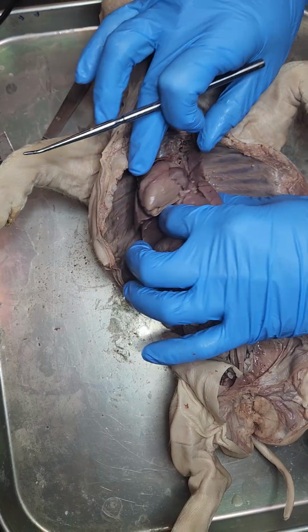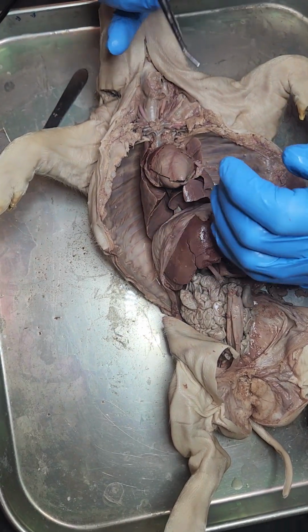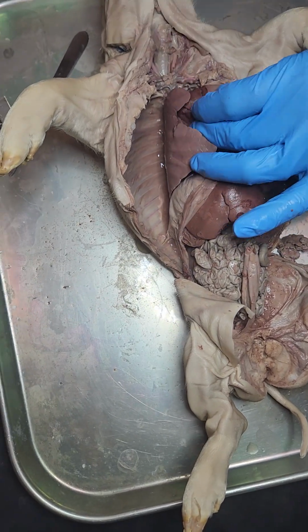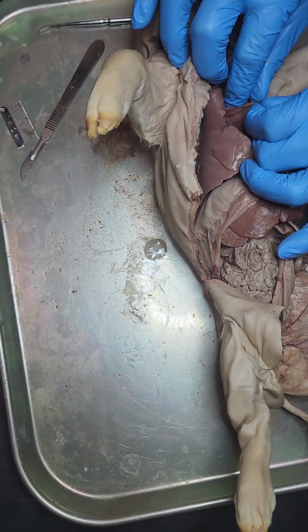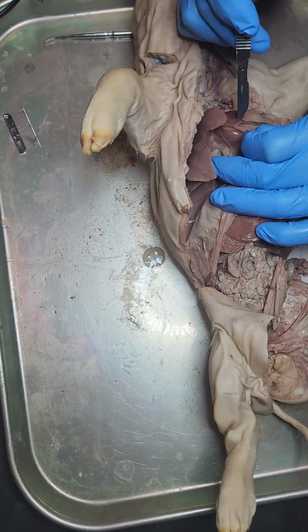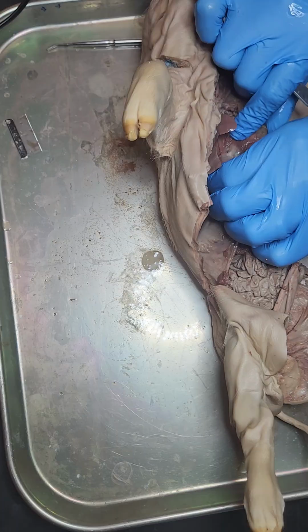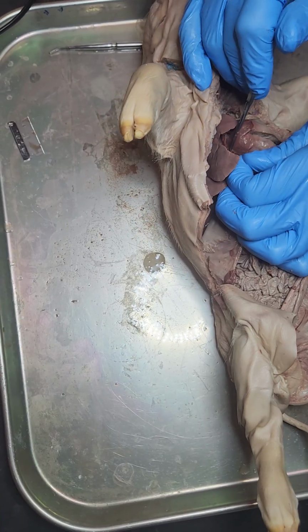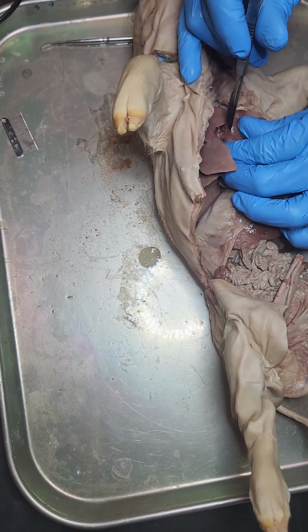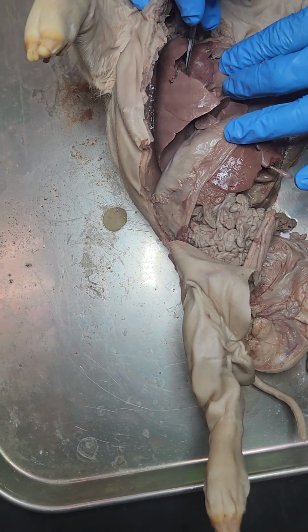Okay. Lungs, so here are your lungs right there. And then we have the pulmonary vein. Now the pulmonary vein is what comes from the heart in. And we will have to clean it up just a little bit. Okay. So we'll just take our knife and sort of clean this out right here. We're going to trim this pericardium back so we can see. There's going to be a vein that comes in from this lung right here into the heart. Okay, so let me see if I can find it here for us.